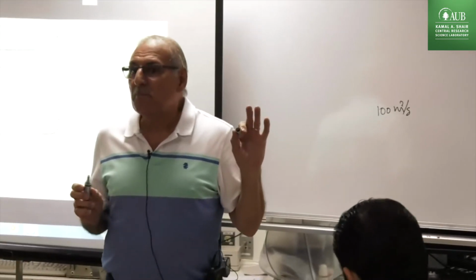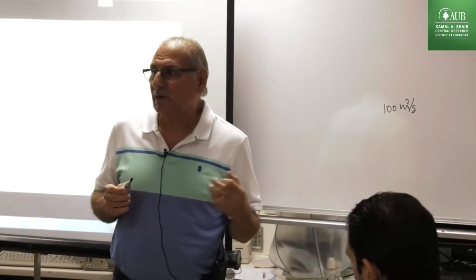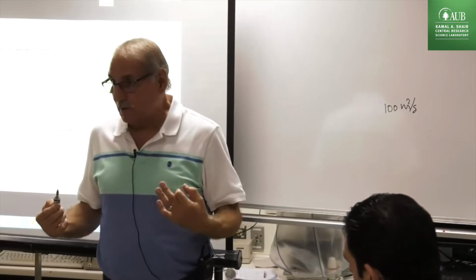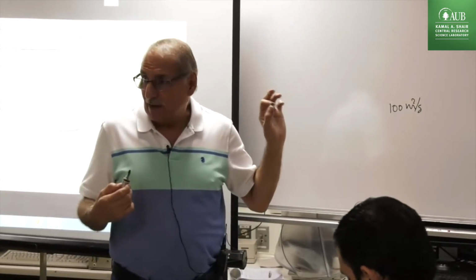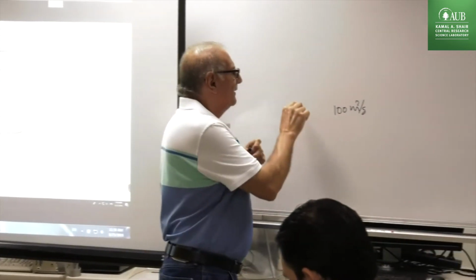Okay, for example, metal oxide, maybe 1 meter square per gram, maybe half a meter square per gram. You only measure the surface area with krypton with no porosity, only BET, because it has no pores. If you have pores, you have surface area. So the silica is the best case as for micropores materials, 100 square meter per gram. Okay, this is micropore.